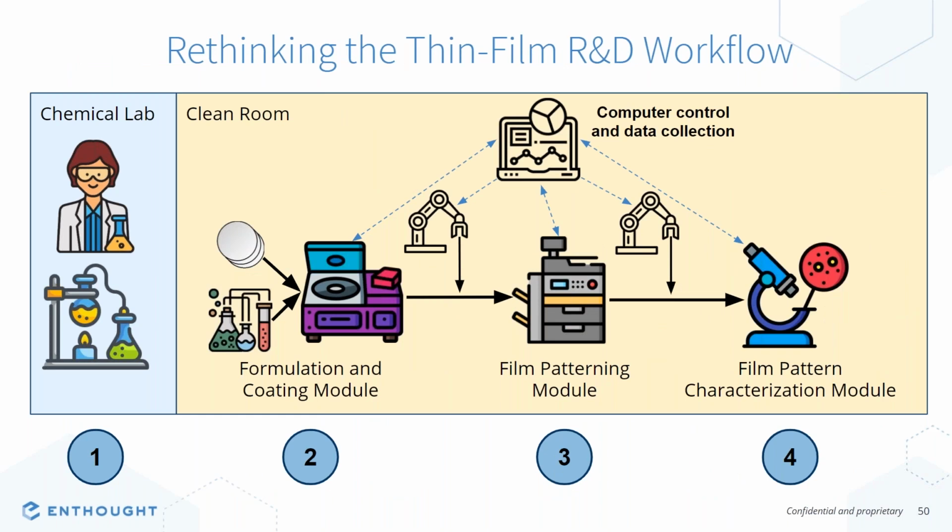And you can start scoping this out, or you can envision here with cartoons how you might group some of these tasks into certain modules and have automation along the way. But designing and automating the system is complex, right? This is a complex, difficult process. The idea you're going to automate this from front to end all at once is hard. It's risky. It'd be very expensive to undertake this all at once. And so as you're transforming and starting to dabble in laboratory automation, it's important to take this in chunks.